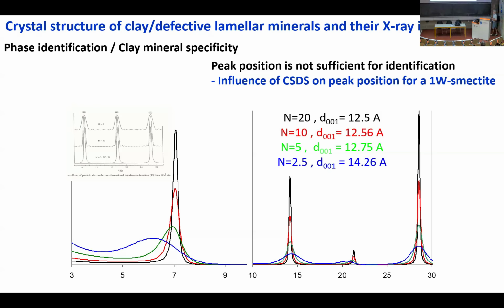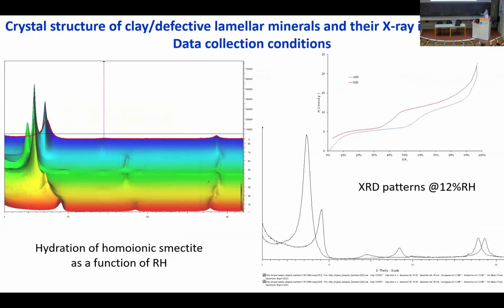You may have delamination at some point, but for example, cation exchange or control of the relative humidity should play a minor role, I would say, at least for dioctahedral micas, etc. It may not be useful to use all this care for all samples, but in some cases, if you want to assess minor variation of the smectite interlayer composition, it may be worth actually using all these.